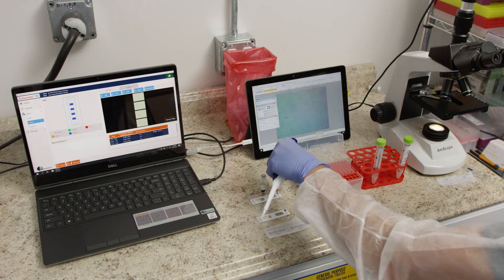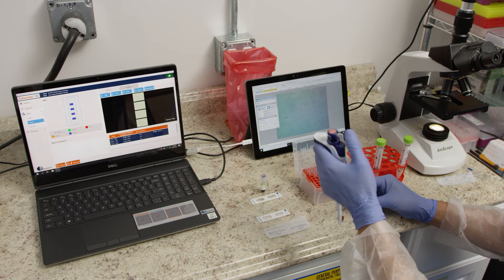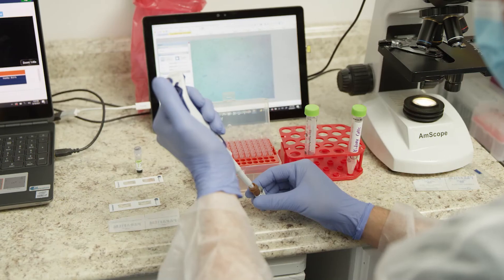Automated cell counters can be used to quantitate the yield of nuclei. Refer to your user manual for details on the operation of your specific cell counter.